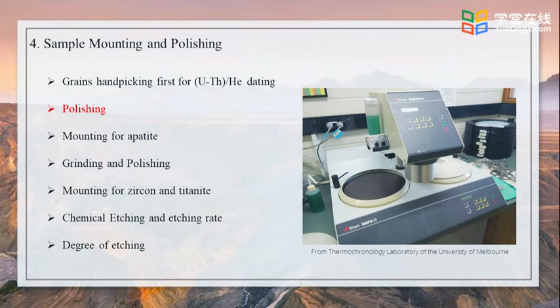The polishing step described in this section is to establish a flat and well-polished surface in an appropriate crystallographic orientation that results from the removal of sufficient external grain material to expose an internal grain surface for analysis. Monitoring and proper washing should be made carefully, while over-grinding and polishing should be avoided.